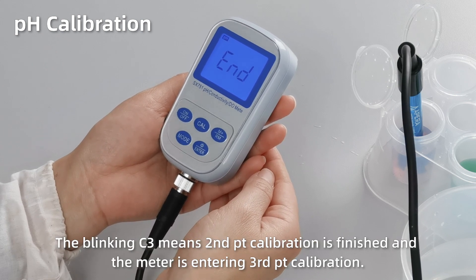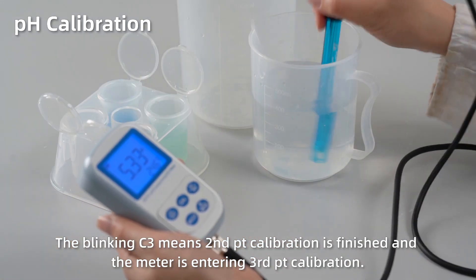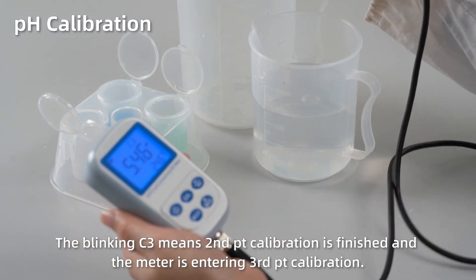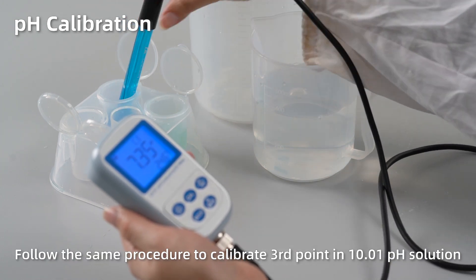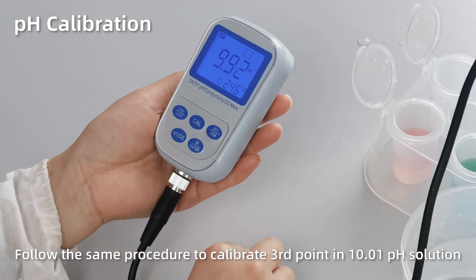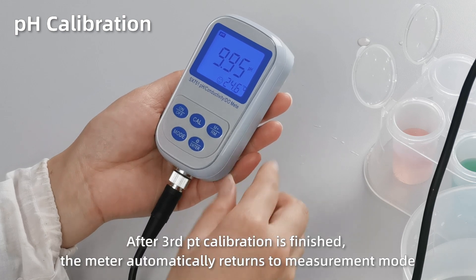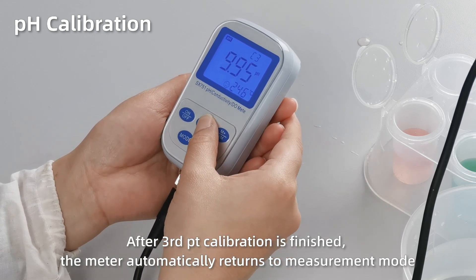The blinking C3 means the second point calibration is finished and the meter is entering third point calibration. Follow the same procedure to calibrate the third point in pH 10 solution. After it's finished, the meter automatically returns to measurement mode.